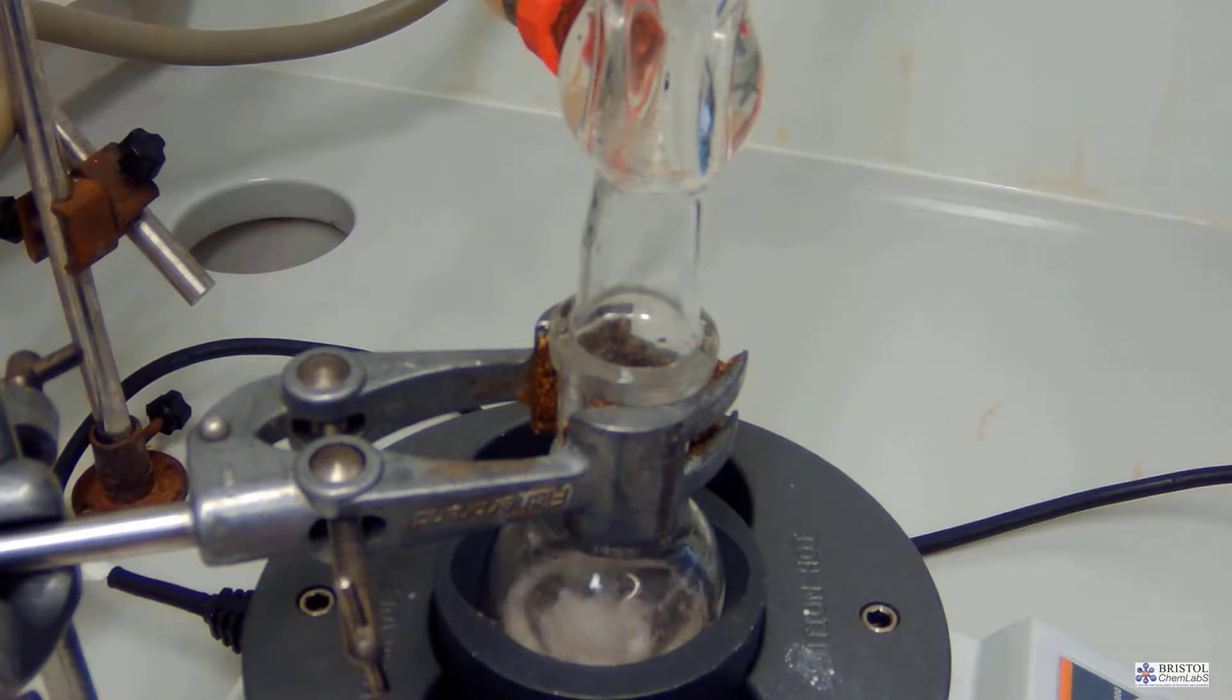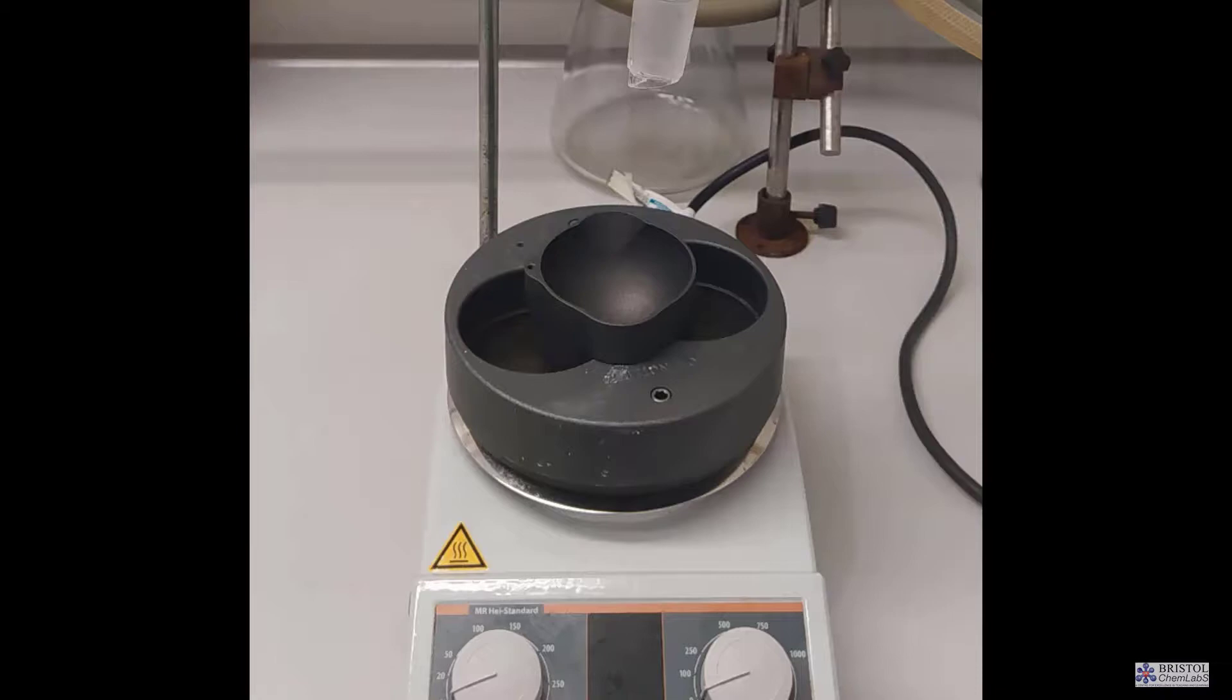If you notice there is an additional piece to a normal heating mantle that surrounds the lower half of the round bottom flask to make sure heat is delivered more evenly.